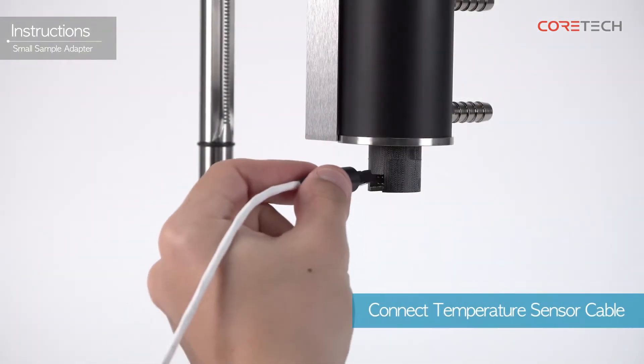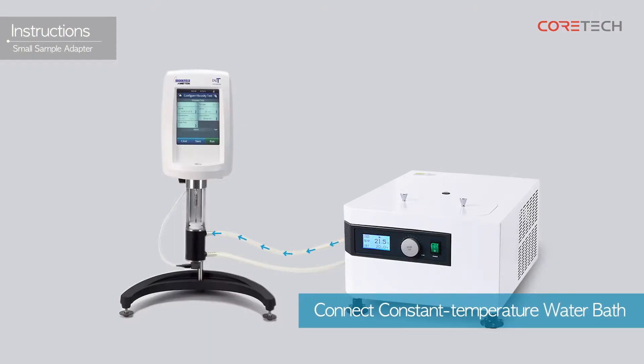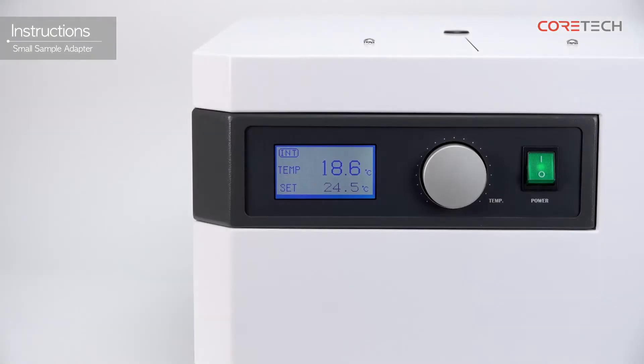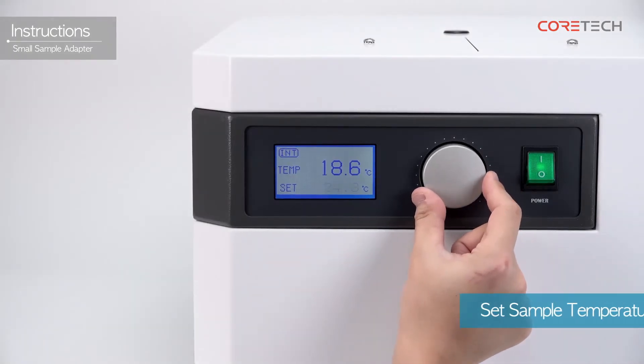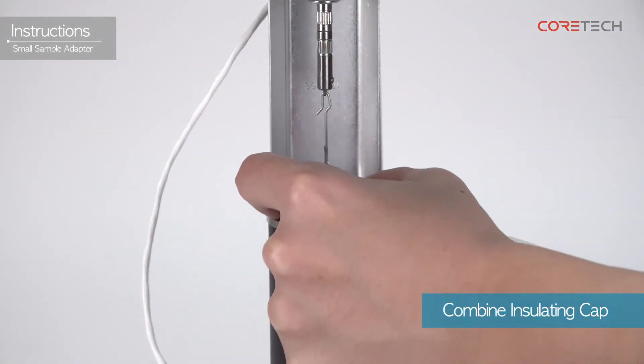Connect the temperature sensor connection cable. Connect the constant temperature water bath by connecting the hose to the nipple on the water tank and constant temperature water bath. Set the temperature of the sample using the constant temperature water bath, then combine the insulation cap.